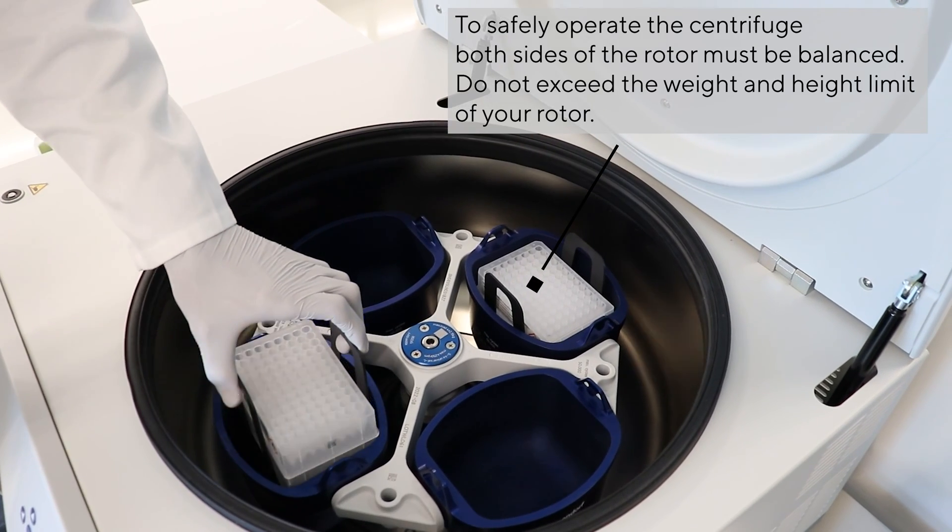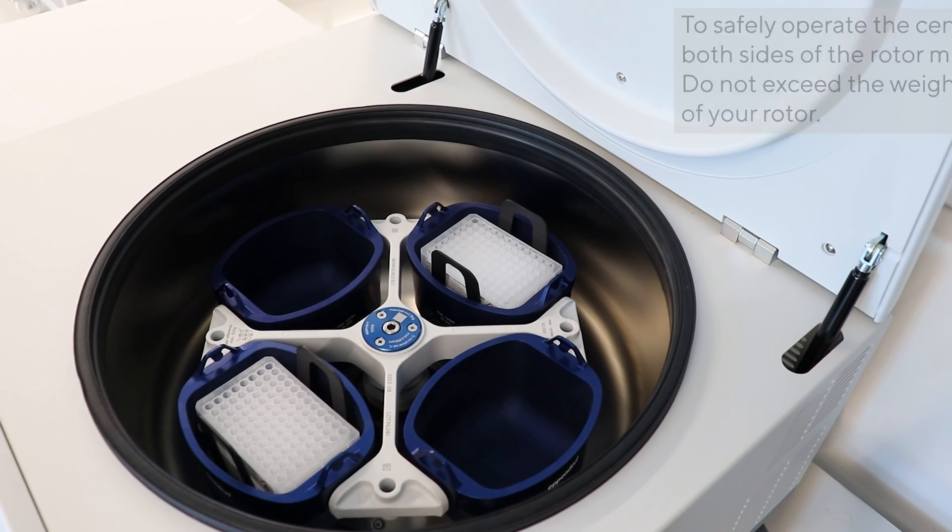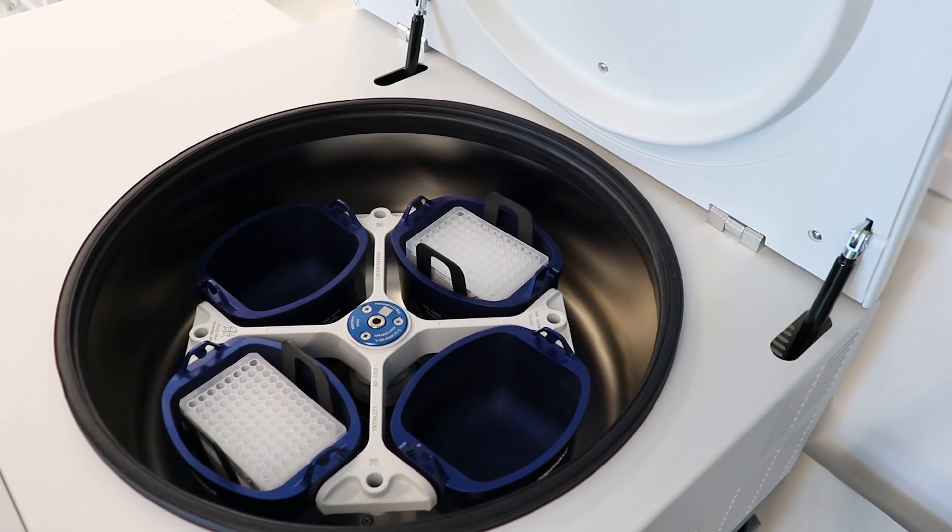Plates can be operated with up to 1000 RCF. At this setting, we need about a minute to empty half a milliliter from the wells.